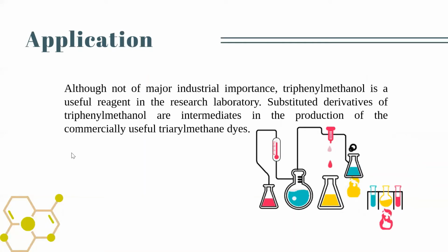So for the application, although it is not of major industrial importance, triphenylmethanol is a useful reagent in the research laboratory. Substituted derivatives of triphenylmethanol are intermediates in the production of the commercially useful triarylmethane dyes.